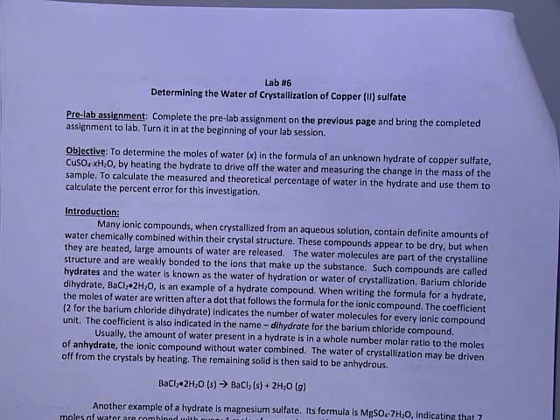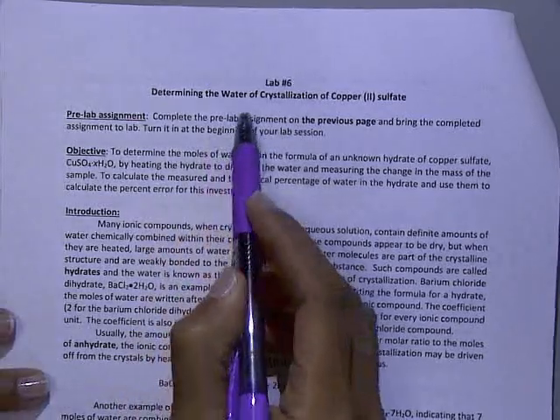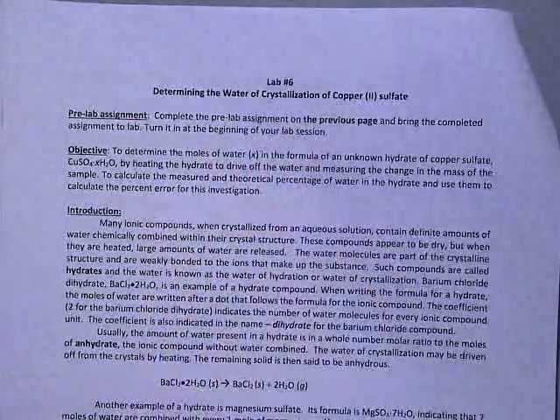Hi class, we're on to week 6, lab 6 of Chem 111. This week's lab is to determine the water of crystallization of copper(II) sulfate.